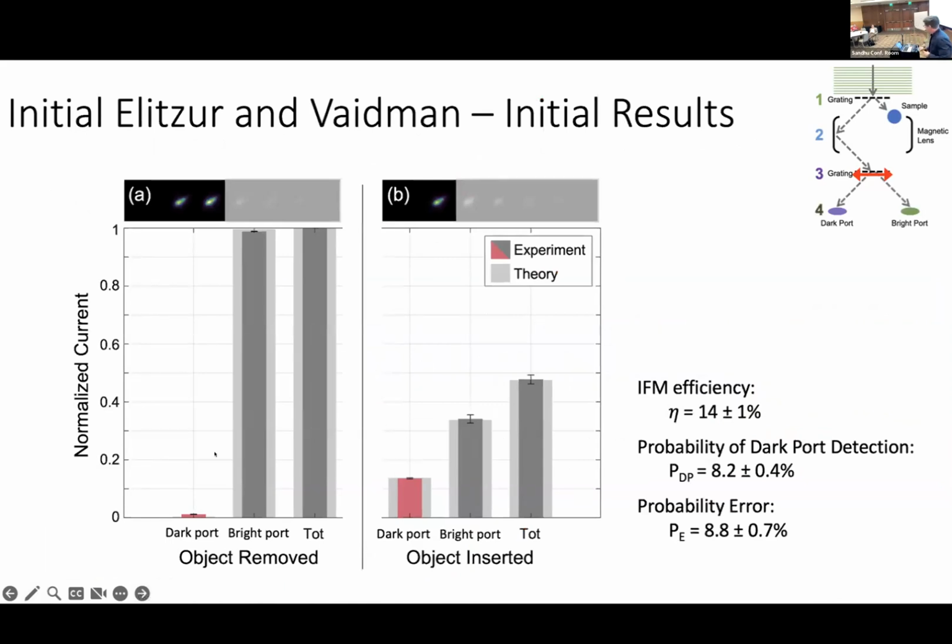If we have just a bar graph and count this, for every electron that goes in, they're all going in here. We have some dark counts at that pixel location. And if we just add those two, that's our total number. Now this is our beam in the interaction plane. So now we've apertured off our probe beam, and we see our dark port counts increase.